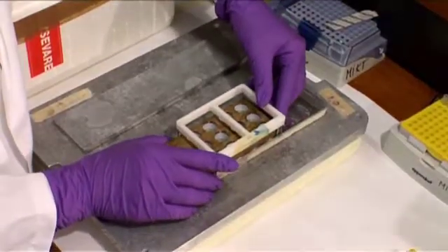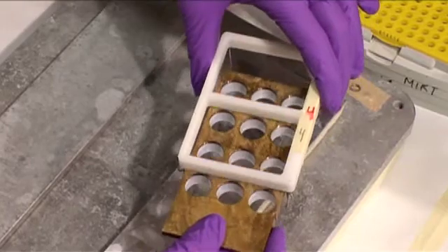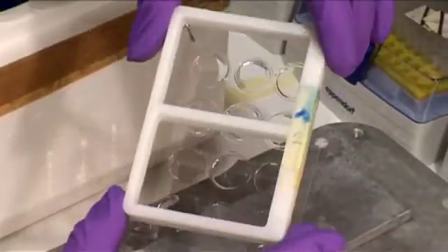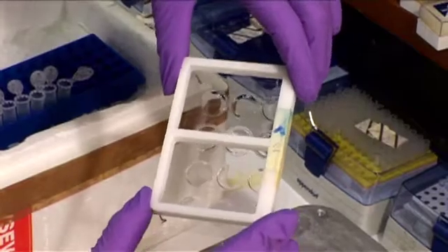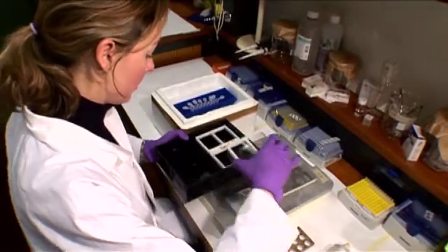And now I will remove the heavy well plate. I'll do like this. And there we have 12 agarose gels with cells molded into it. And now we can transfer the gels to lysis buffer, which we have here, which is cold.